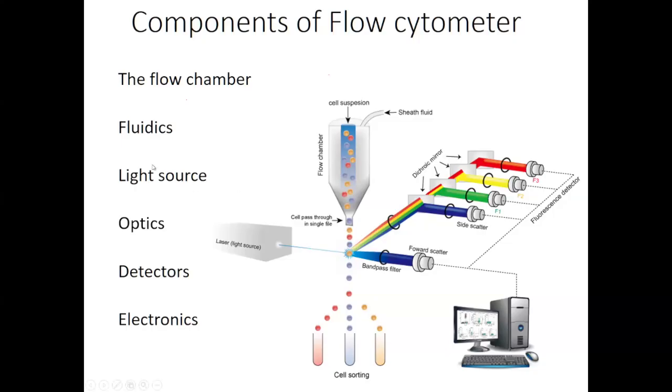This is going to be very interesting. I told you that these are the cells. They are made to come in a single file pattern because of hydrodynamic focusing, because of a faster moving sheath fluid, which at the funneling area pushes the cells to the center, and they all fall one after the other in a single file pattern, right?